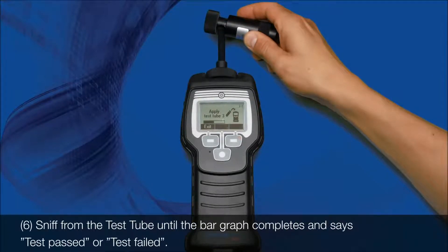6. Sniff from the test tube until the bar graph completes and says, test passed, or test failed.